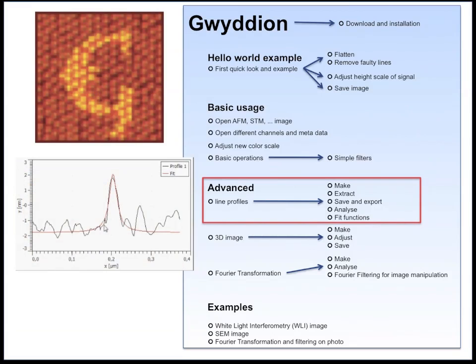Further, I will show you how to make a line scan through an image and export the data, how to fit functions to this line, and how to use the data in Excel, for example, and in other programs.